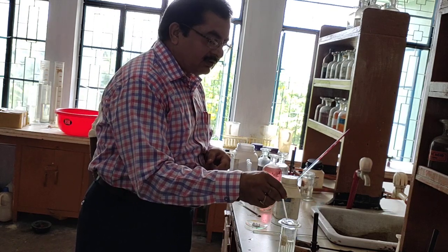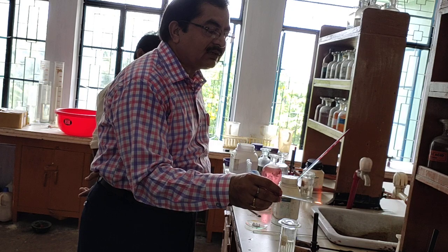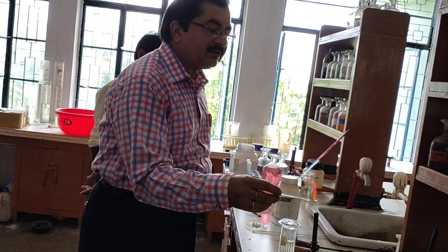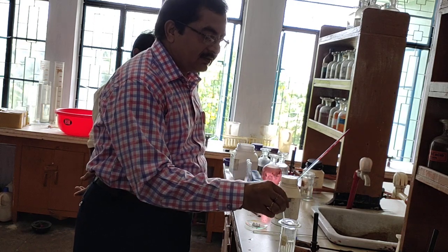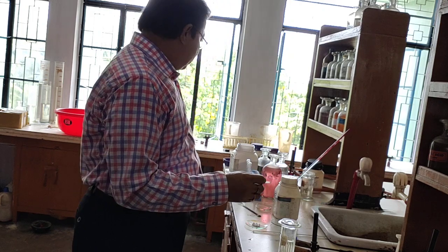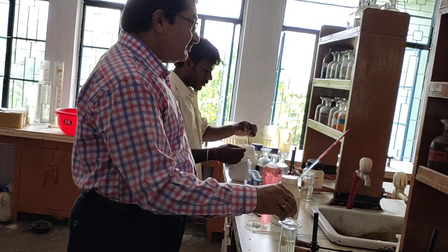The third test, same flame test for third salt. See here clearly it is coming. Brick red color is coming. It is coming brick red. All right. Now the fourth one, strontium.